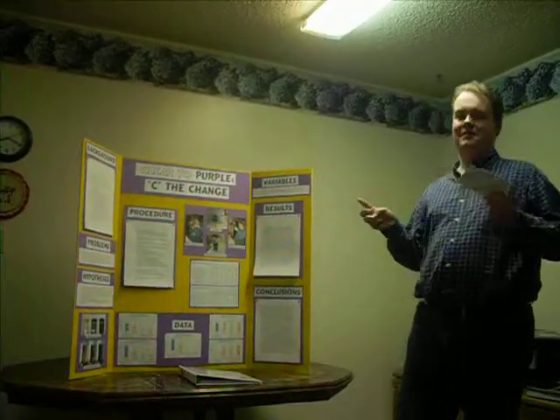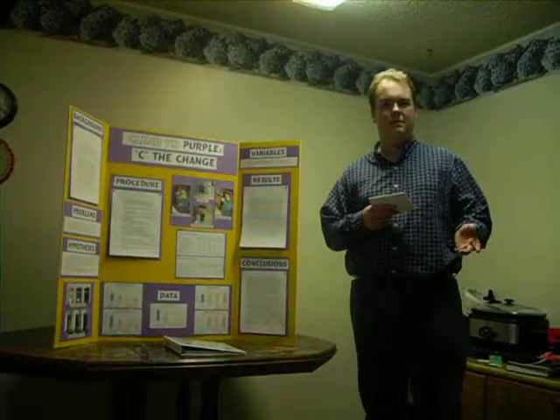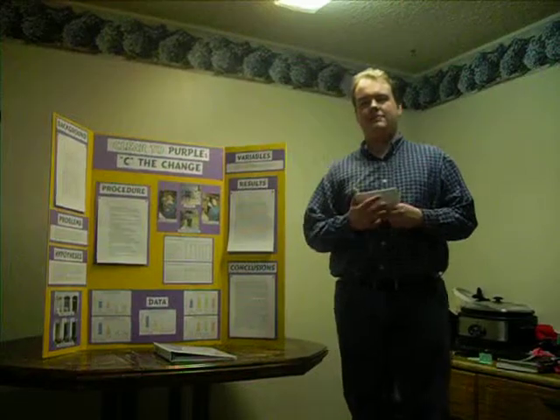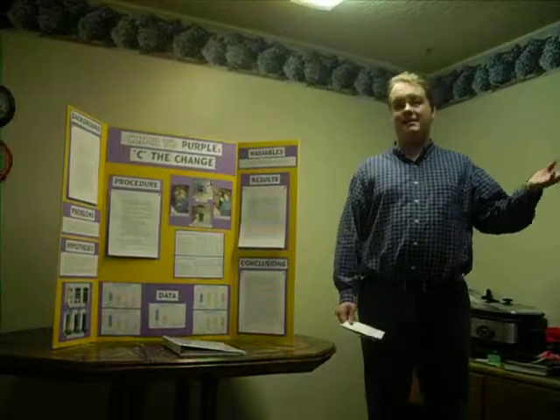Okay, for the vitamin C one, there's a multitude of things. First of all, equipment wasn't the best. Even just getting laboratory equipment would help. You could definitely use better quality vitamin C stuff. Basically, I used ground up pills from untested companies.